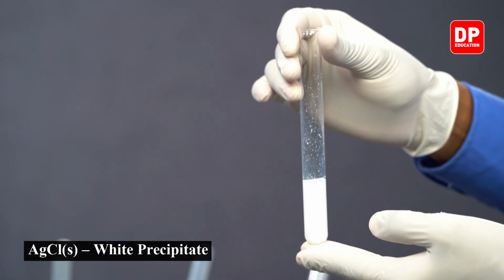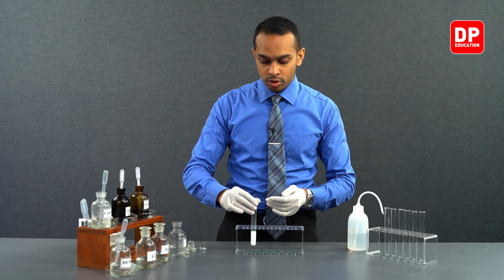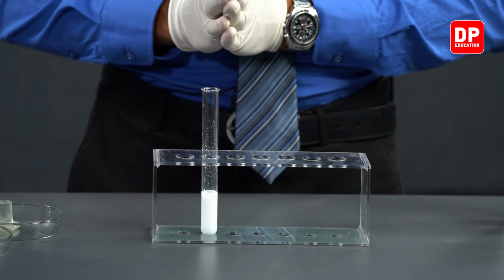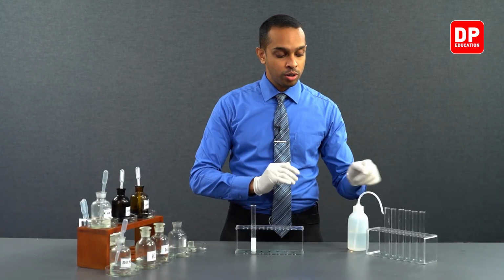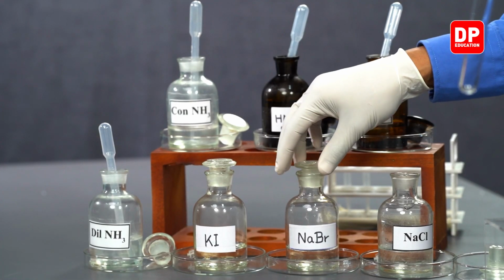So the purpose of this section of the practical is to compare the colors of the three precipitates. So we will leave silver chloride precipitate here and we'll move on to reacting sodium bromide with silver nitrate.